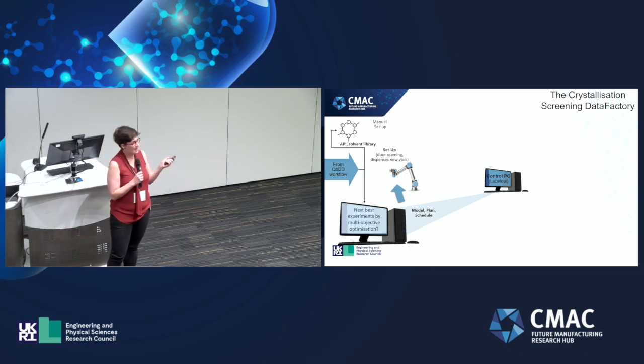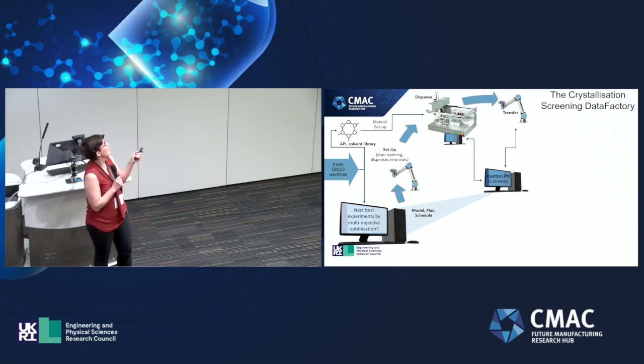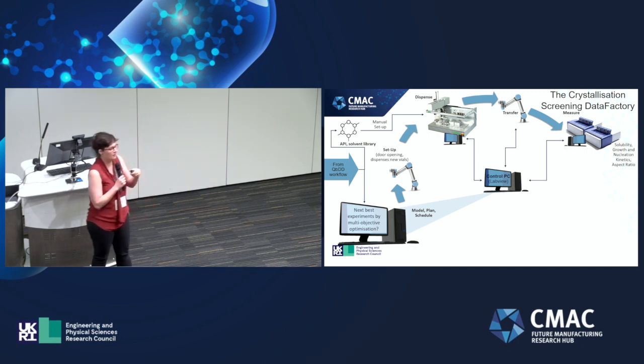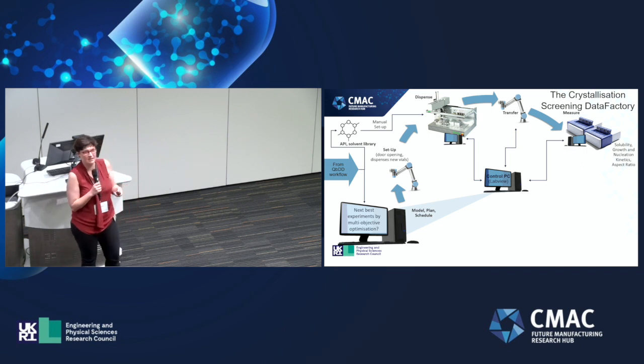So it gives an empty vial to our solid-liquid dosing robot, which then, once that's dosed out, can be transferred into our Crystalline instruments, where we're collecting a rich data collection of image analysis, transmissivity, to give us information about particle shape, size, nucleation, and growth kinetics.